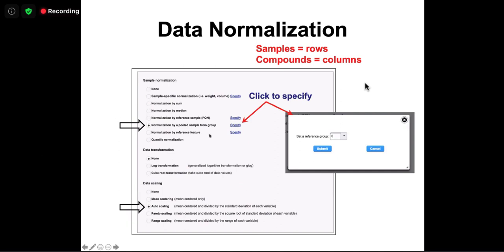What we have done for this one is create a reference group. Basically, selecting one sample could be subjective. It's hard to reproduce, so we want to select an average. We want to create an average sample based on a reference group. So you have a reference sample.